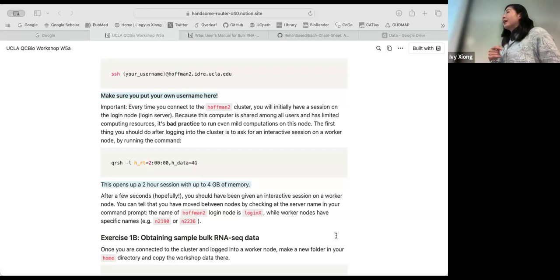And then for labs with their own node, that's good news. So you have basically reserved capacity for your whole lab. There are cases where I have to wait for 2 hours for a node at some point during the day. And then the lab node is much faster. So that's about the options we have on the cluster.